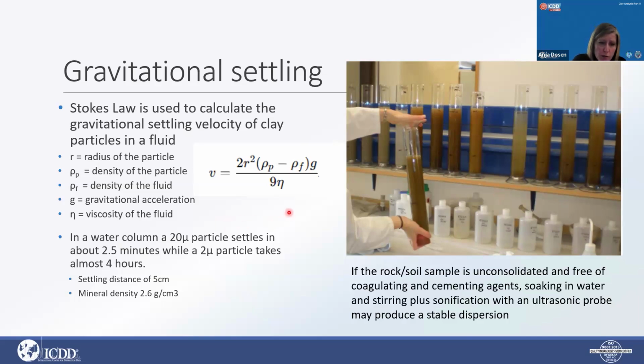The fluid is water, so density and viscosity are one. As you can imagine, and we said already, heavier particles are going to fall faster. And as you can see, most of these are darker here at the bottom and lighter at the top. And this is where we want to look for clays.